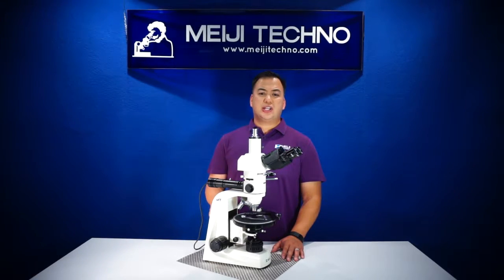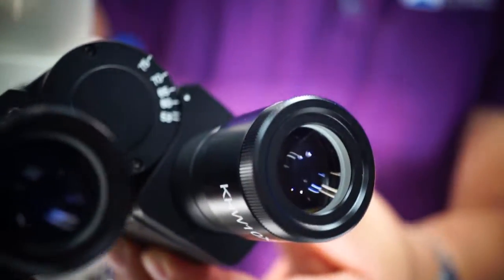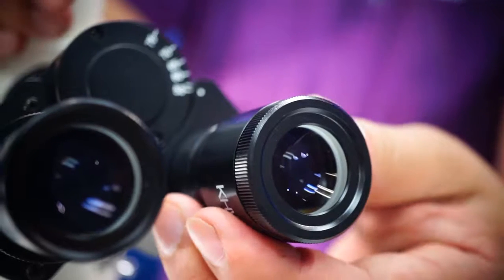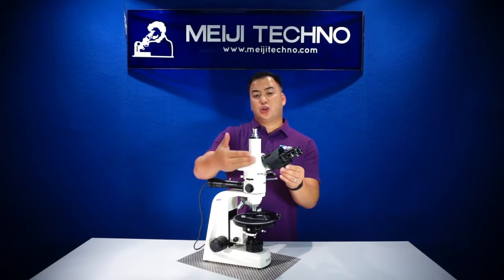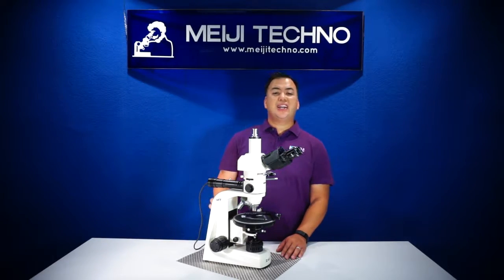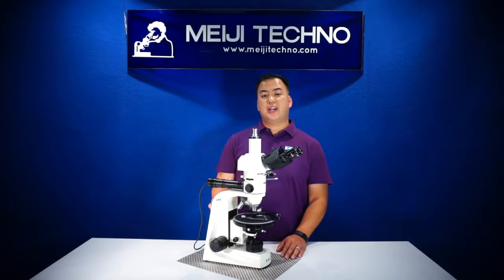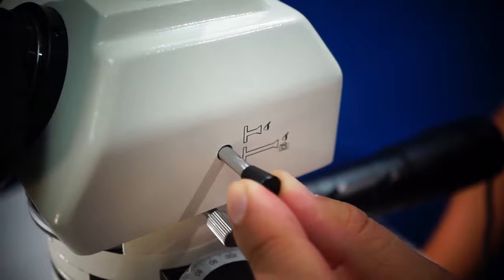The MT9900 series is equipped with 10X eyepiece and 10X focusing eyepiece with a cross-line reticle. Available with a side-on-top style binocular or trinocular head inclined at 30 degrees, the MT9900 series trinocular head comes with an 80-20 beam splitter for image or video capture.